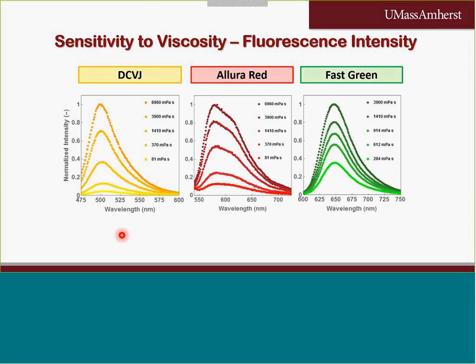So basically what you do is you include that molecular rotor into a solution of different viscosities, and measure the fluorescence intensity of them.